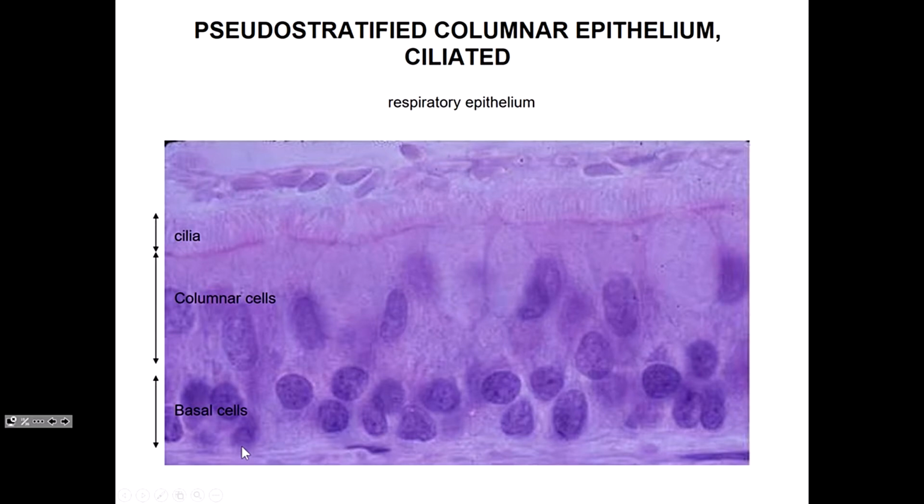But hopefully, you would be able to recognize it's got these cilia on top, because these are much more fibrous than if they were microvilli, that this might be from the respiratory epithelium of the pulmonary system, in which case it would be pseudostratified columnar epithelium. So the question might be, classify this epithelium from the bronchiole, which is a component of the pulmonary system.